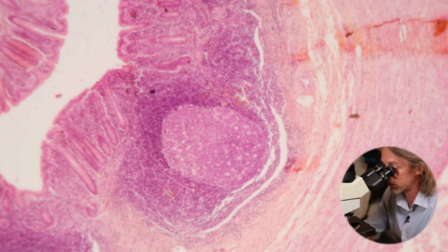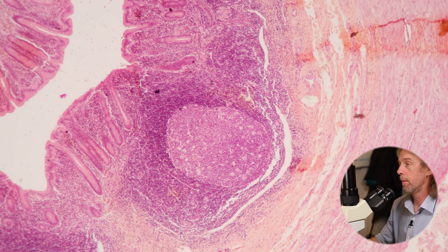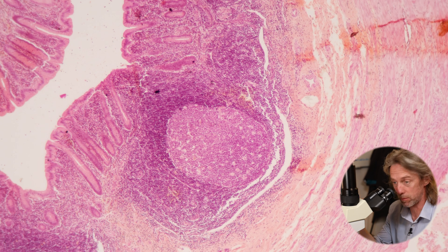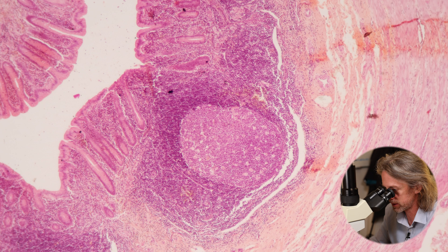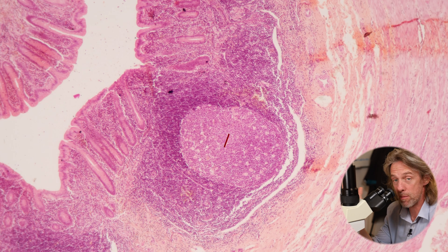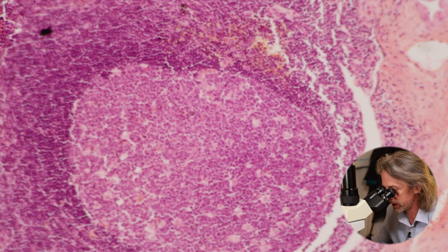In those lymphoid follicles we're going to have T lymphocytes, B lymphocytes, macrophages, and eosinophils. These lymphoid follicles are the immune system — this is where the immune system lives in patches of lymphoid tissue around the body, distributed around the body as well as cells being in the blood. We can refer to this as GALT — gut-associated lymphoid tissue — or MALT — mucosa-associated lymphoid tissue — because we're looking at the mucosa here. This gives us a clue as to what's going on in the appendix.